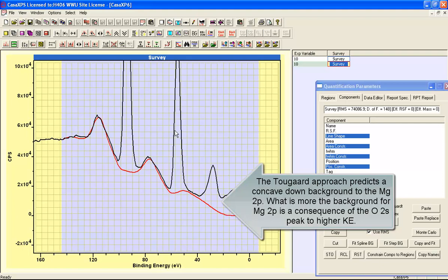So you can see that the 2GAR background is illustrating that the concave down nature of the background beneath the magnesium 2p is a result of this oxygen 2s. So this is a background structure that is resulting from a different photoemission line.